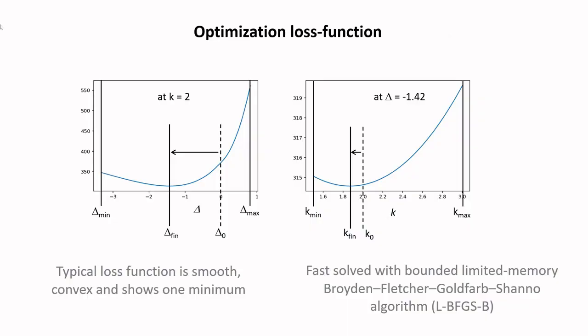Then, your fitting seems to be non-linear. Do you think it has advantages over the linear fit procedures? That is a very good question. Indeed, non-linear fitting has several disadvantages compared to a linear fit. One disadvantage is that we are not guaranteed that there is only one minimum. But that is not our case. Let's look at my backup slide.